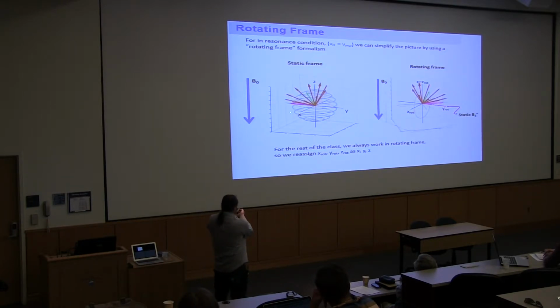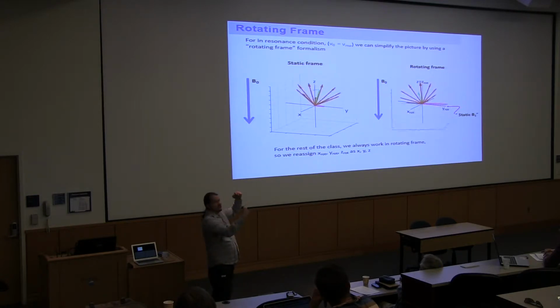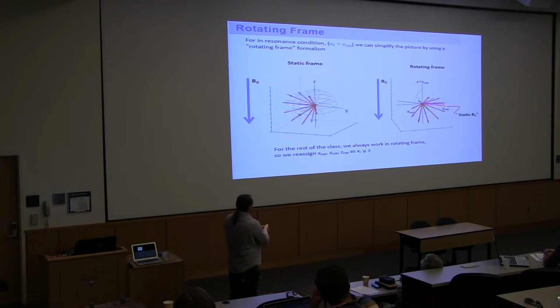If we can go along the Larmor precession with our camera and constantly follow that, in that case, we omit the precessions around the z-axis. And that makes it a little bit simpler. And then the picture will look like this.